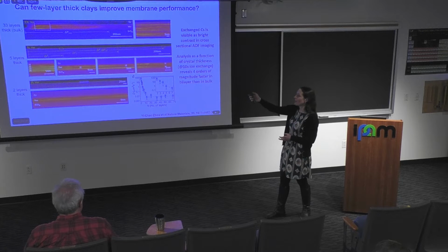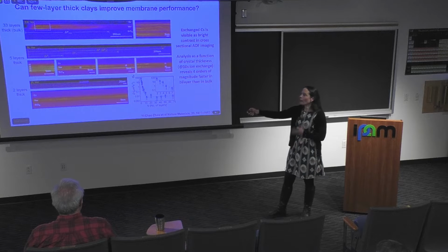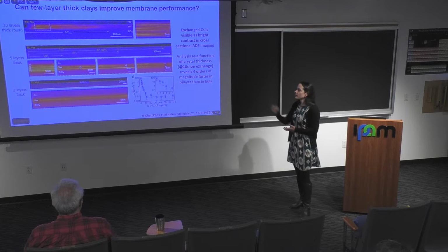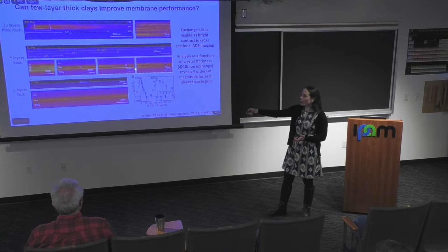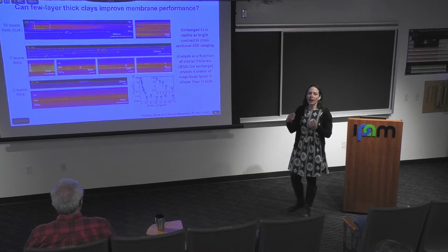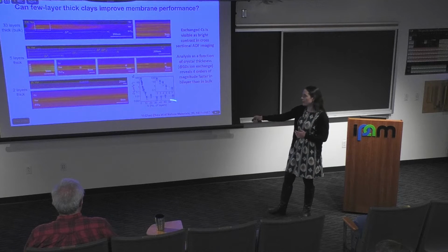And we're now going to interrogate these. We're roughly going to estimate how much of these bright cesium ions are present within these images, understand how far they've penetrated, so we measure the penetration distance along each layer, we measure that as a mean, and then we calculate how far the ions can penetrate into an average layer depending on the thickness of the material.